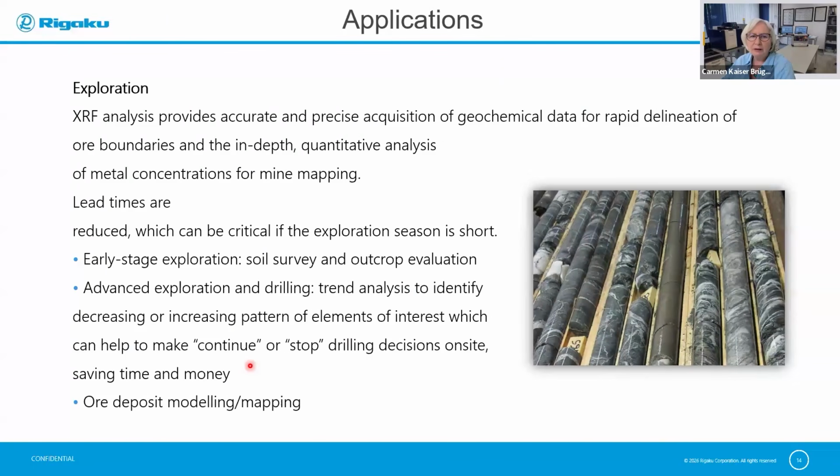So this is an example of a drill core, which is very important to look at the type of mineral that's present and the elements that coexist with the mineral in order to do the ore deposit modeling and mapping correctly for the mining plan.